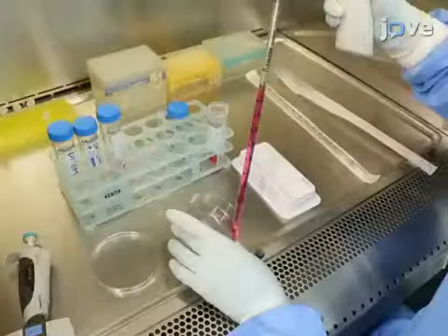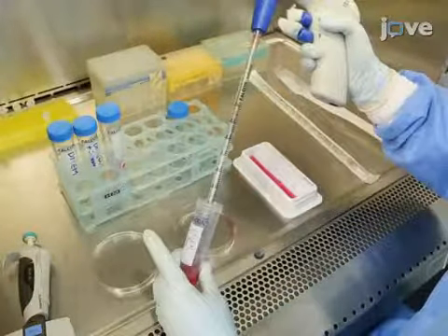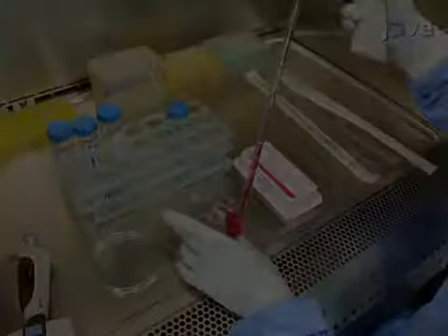After that, replace HEK293 T cell medium with 10 milliliters pre-warmed antibiotic-free fresh culture medium mixed with 1 milliliter of DNA transfection solution.